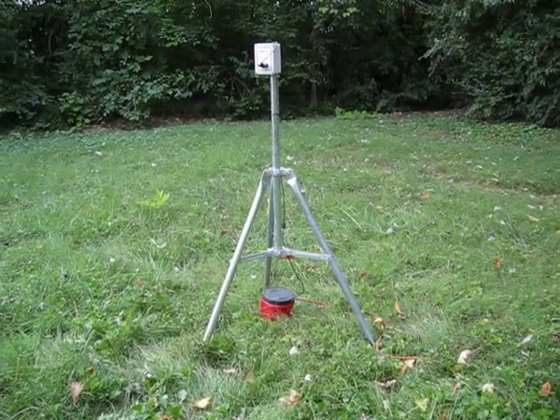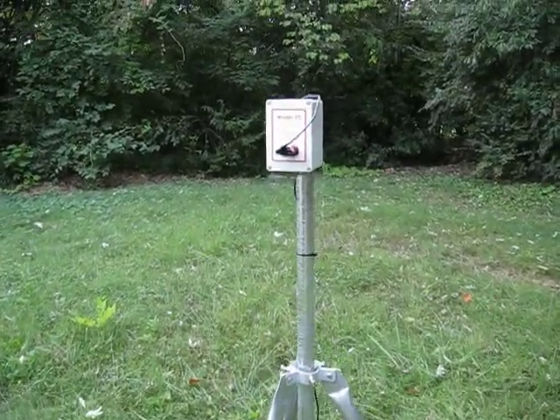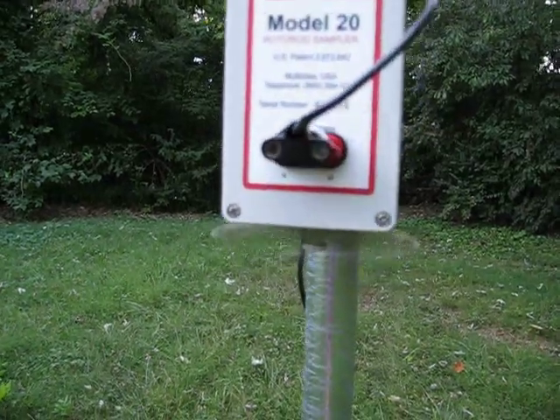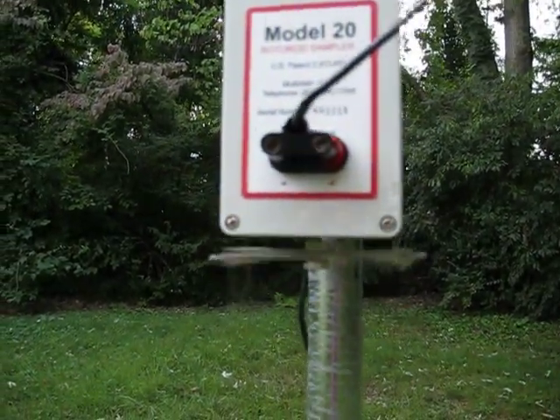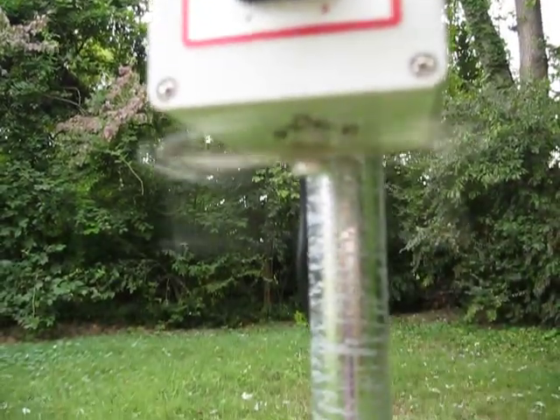On the tripod that you see is the Rotorod Model 20 unit. Basically what we have going on is a whirling motion. Let me move the camera here so maybe you can get a good look at this.